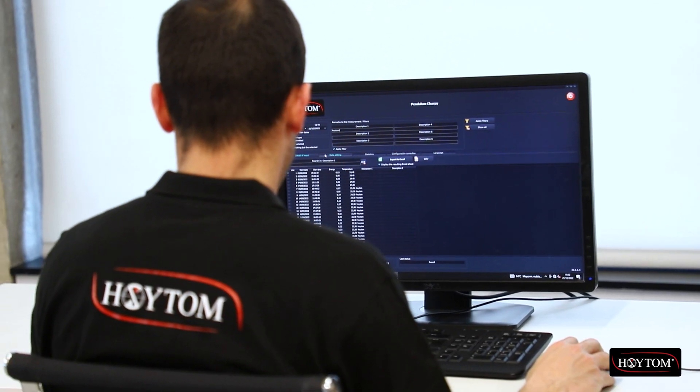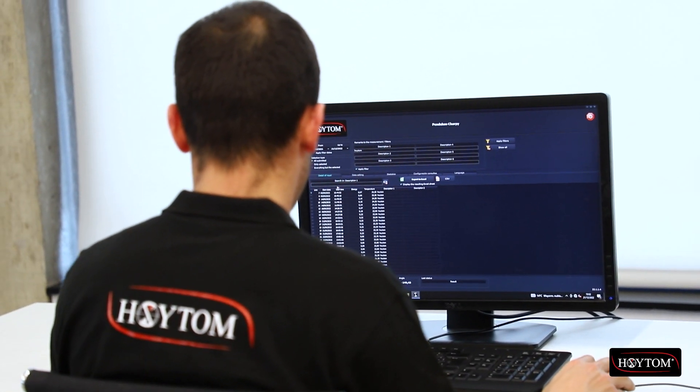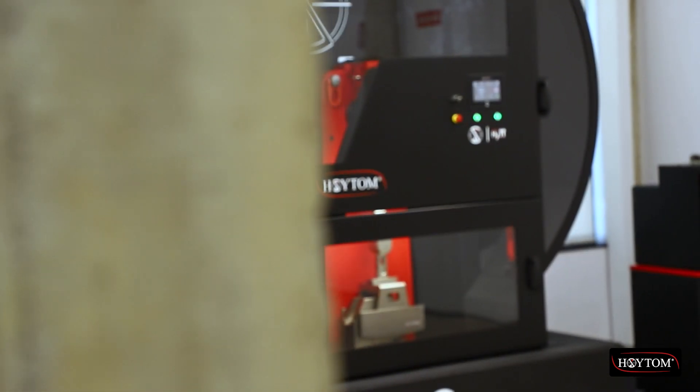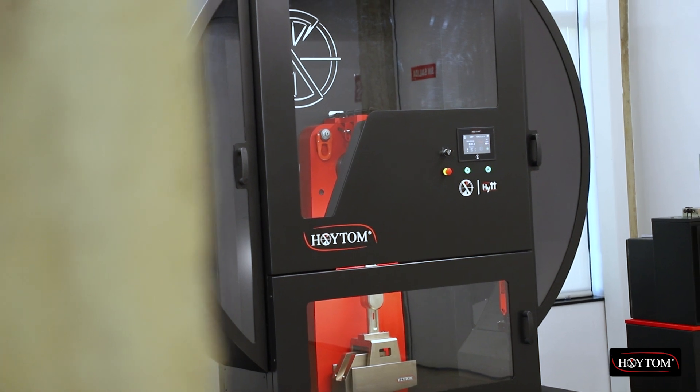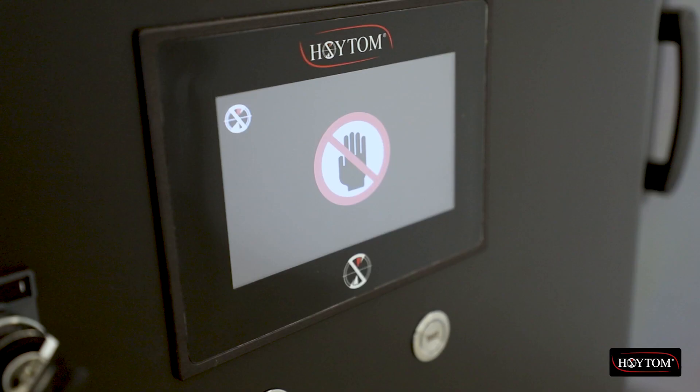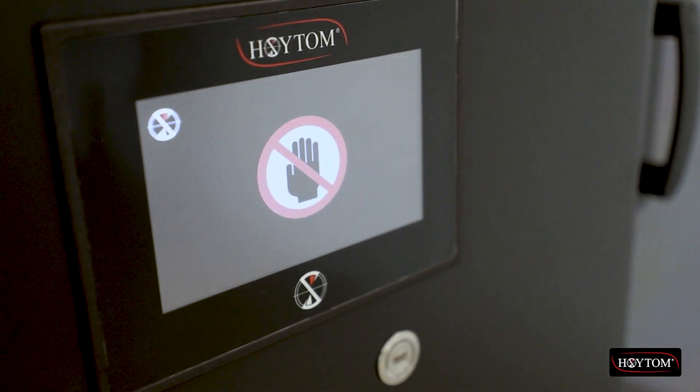You can connect a computer via USB and manage the data via our OiWin Pendulum software. Safety of our products is a priority at Oytom, and the electromagnetic brake allows the hammer to be launched safely, preventing it from falling even in the event of a sudden drop in mains voltage.